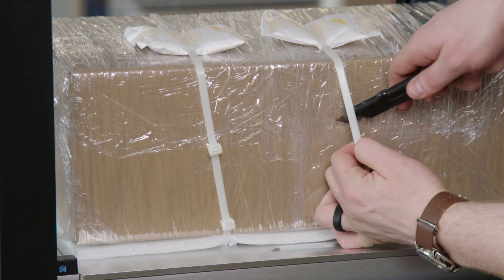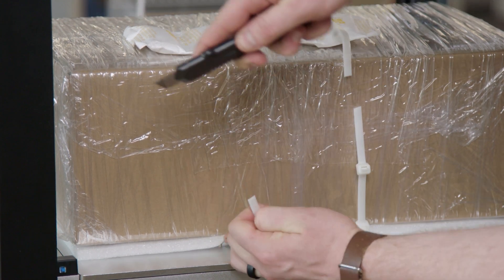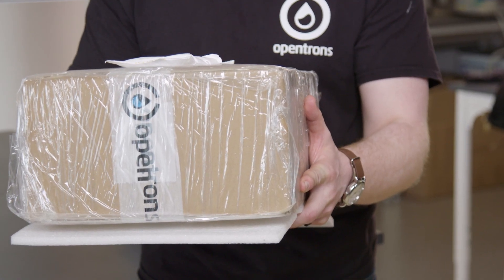Lastly, I'm going to cut the zip ties holding the accessory box to the deck. This accessory box includes all the equipment I need to set up the OT2, so I'll set this aside.